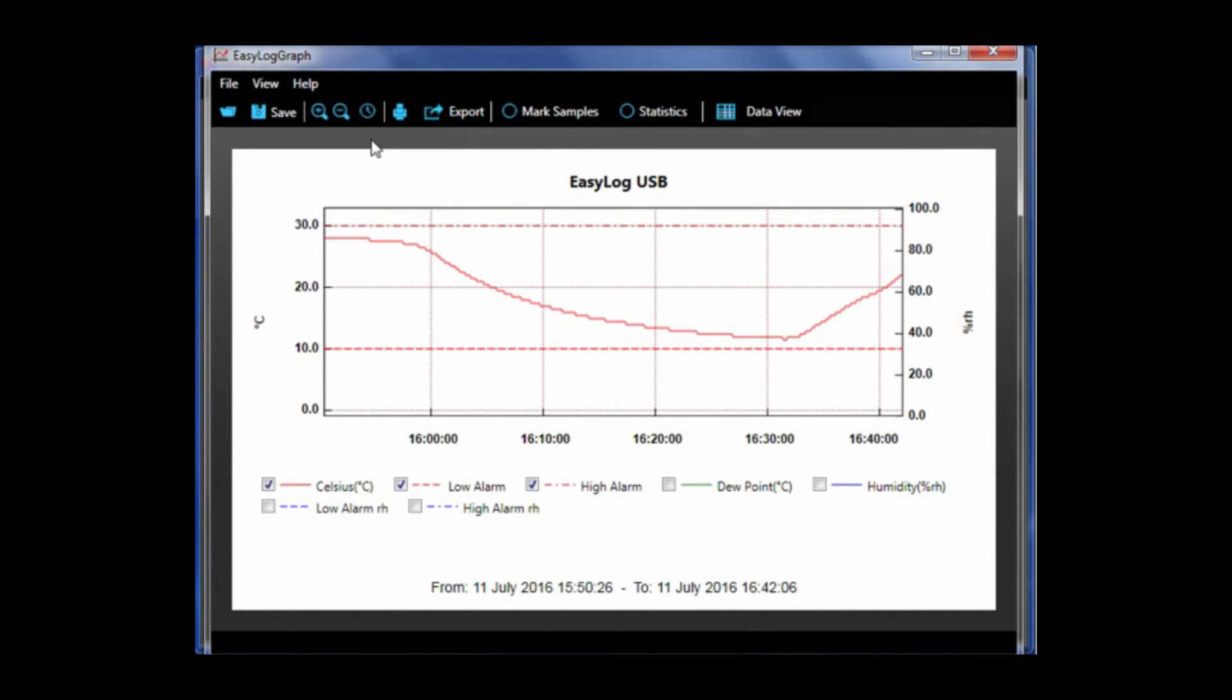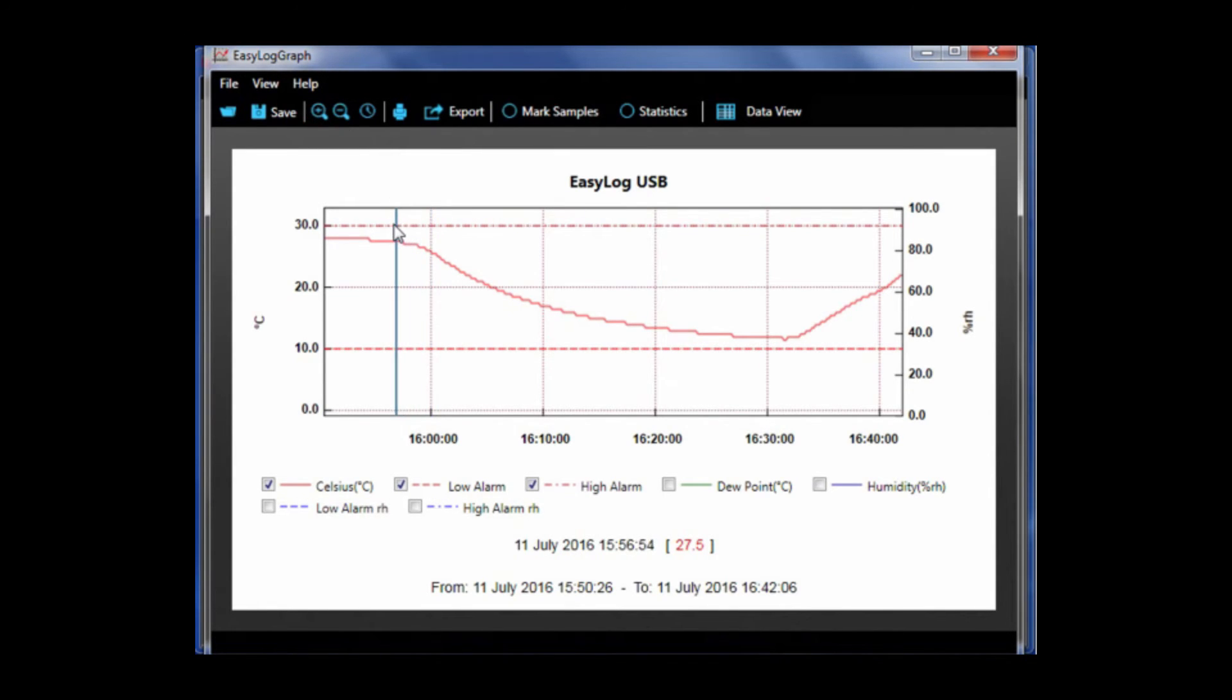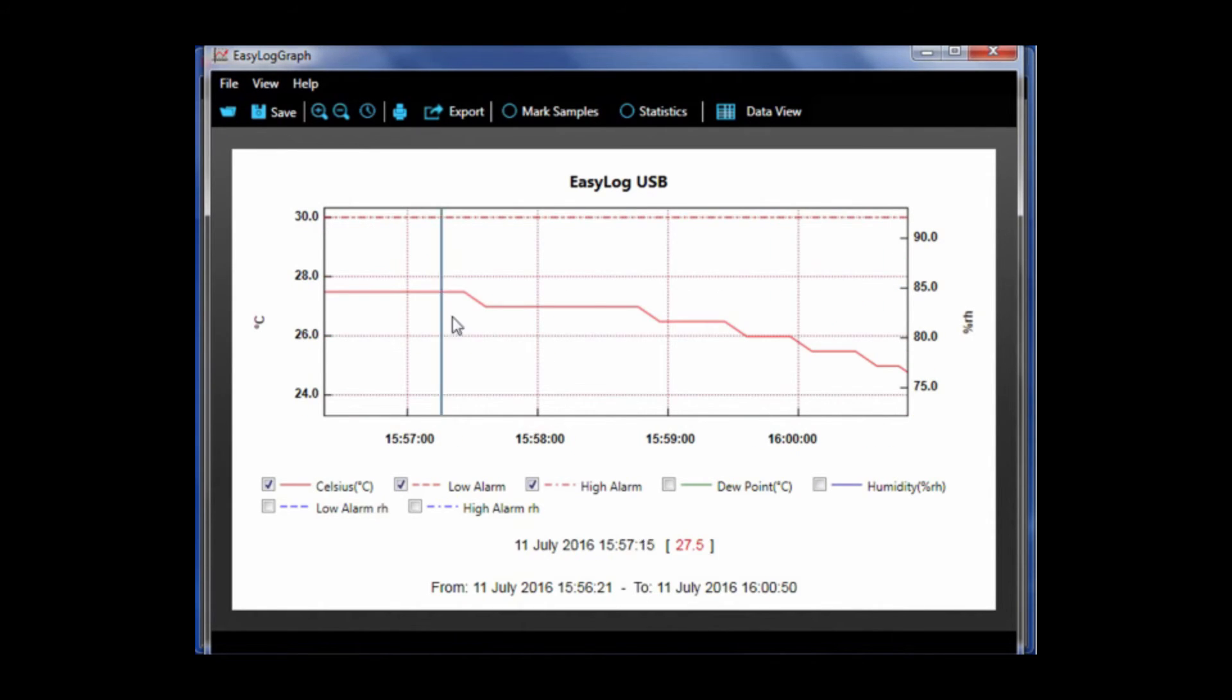I'm now just going to zoom into a particular area. I simply drag the cursor over the desired area. This allows you to analyze the data a bit more closely.